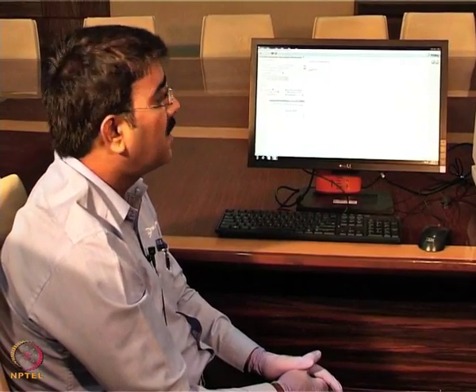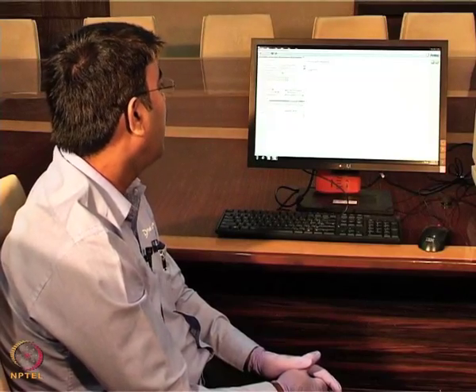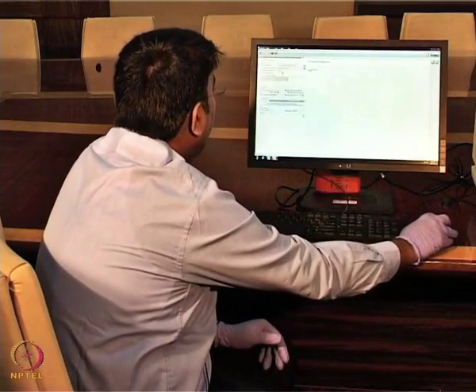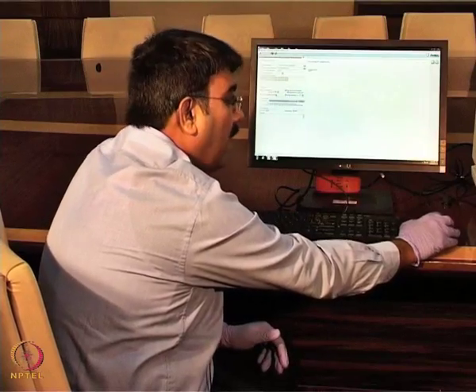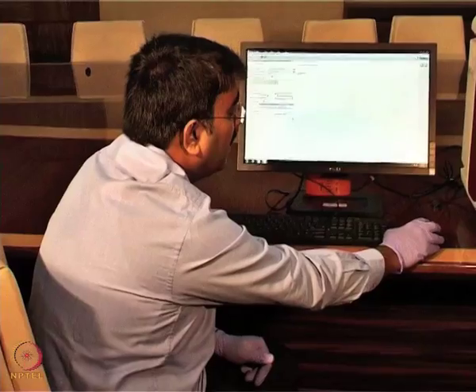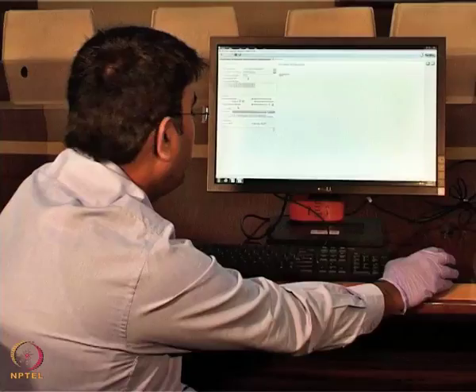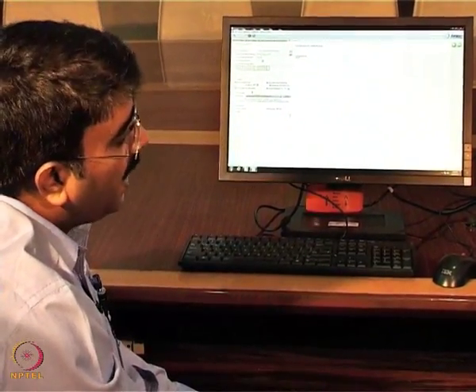Whenever you are performing the experiment, sensors have to be hydrated prior to the experiment. At least 10 minutes is required for hydration. Suppose your sensors are not hydrated, we can set a delay of 600 seconds in the software, which is nothing but 10 minutes. After the hydration, the instrument starts acquisition. The second option is whether your sample has to be under shaking conditions during hydration, because the instrument has a shaker, which will effectively mix.